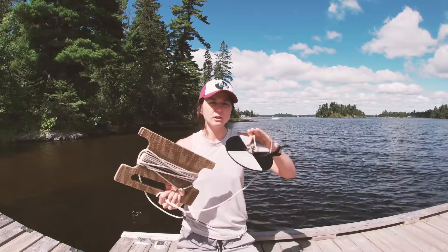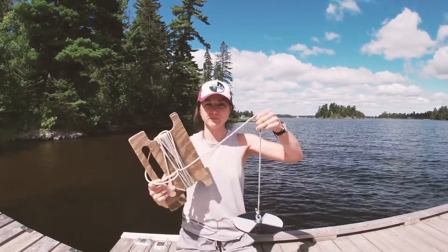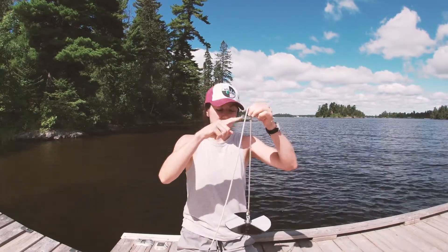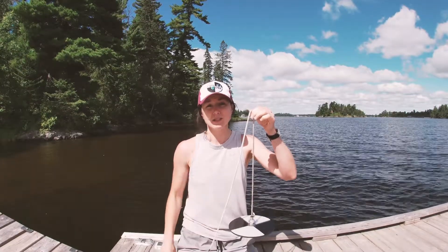How it works is we slowly lower the Secchi Disc into the water until we can't see it anymore. Then we measure the distance from the top of the water to the depth at which we can't see the Secchi Disc. That depth is known as the Secchi Depth.